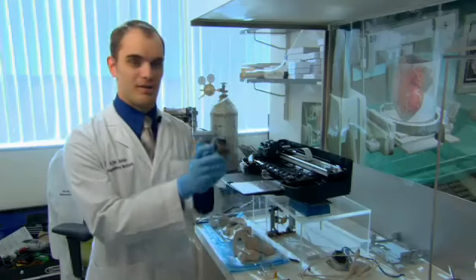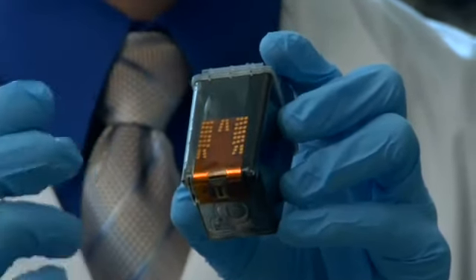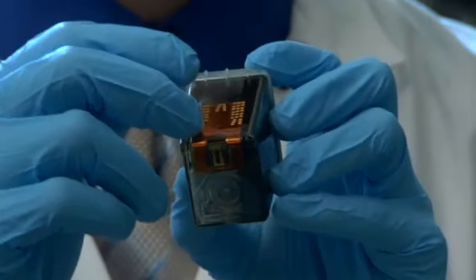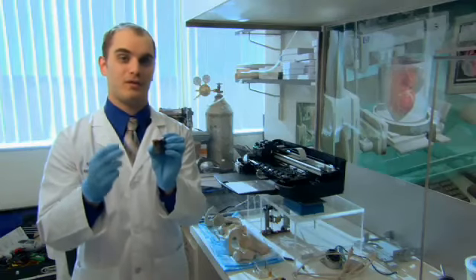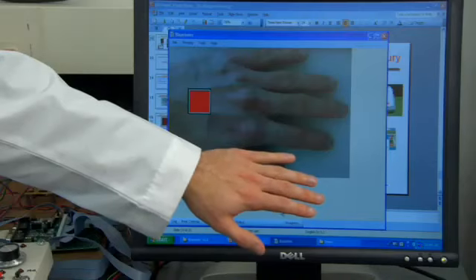Now here is a regular inkjet cartridge. Now when the printer wants to drop a drop of ink, it simply sends a signal to one of these resistors, which heats up this copper wire, and that causes a bubble to form in the ink, which drops out a drop. That drop is roughly the same size as this cell, and that's how we can get single cell precision. So the bioprinter drops each type of cell precisely where it needs to go. The wound gets filled in, and then those cells will become new skin.